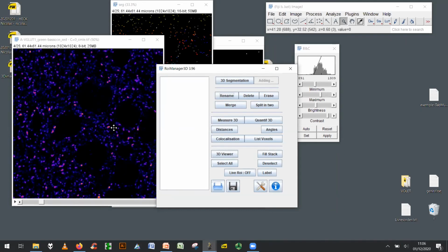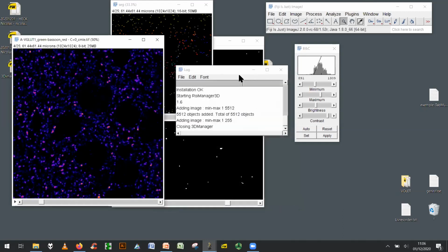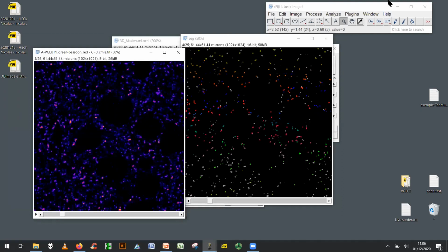So I have to really activate it. Sometimes there's a problem of synchronization, of update, of refresh. So in case you don't see anything in the list, just wait a bit or just rename an object or do something. Sometimes the refresh is not so good. Seems okay now. Problem solved, good.